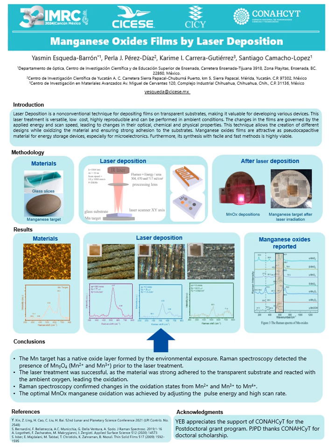When combining the scan speed of 10 millimeters per second with a high pulse energy of 82 microjoules, the intense treatment results in a weak signal from the formed oxides, and the material surface appears more fused. In this case, the radiation lines are not as clearly visible.